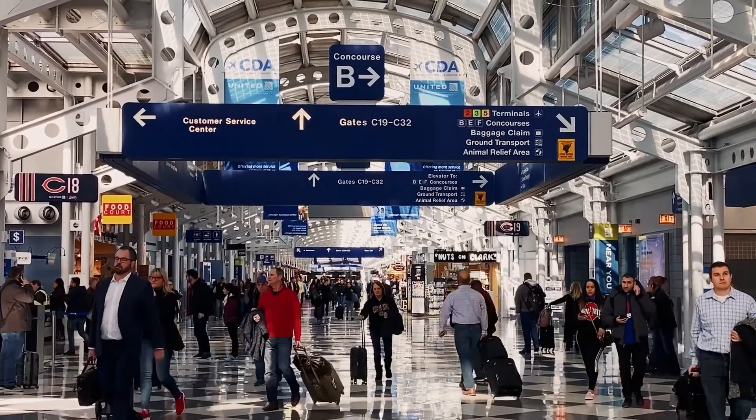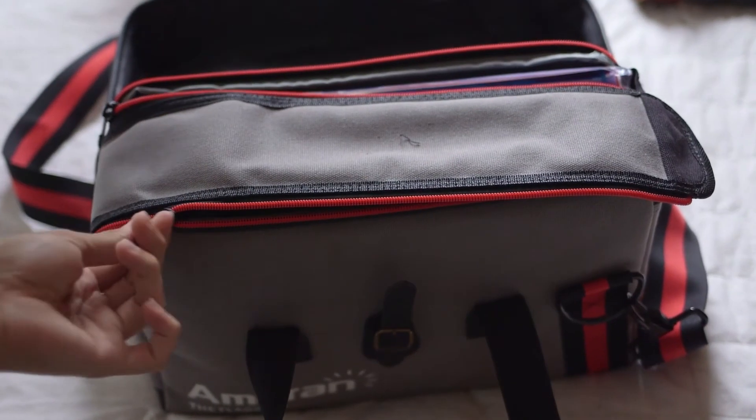One thing to consider when packing up your XRF: if you're flying domestically within Australia, be sure to take your lithium battery out of the case and put it in your carry-on.